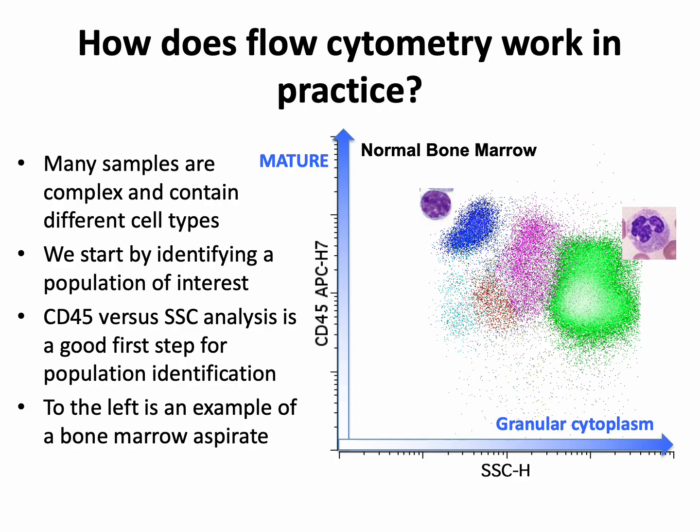These can be contrasted with our granulocytic cells. Now, granulocytic cells have a very high level of side scatter, reflecting the heavy granulation often present in their cytoplasm. When it comes to level of maturation, the granulocytic cells that you'll see in the bone marrow range from less mature cells, such as promyelocytes, to more mature cells, such as neutrophils.